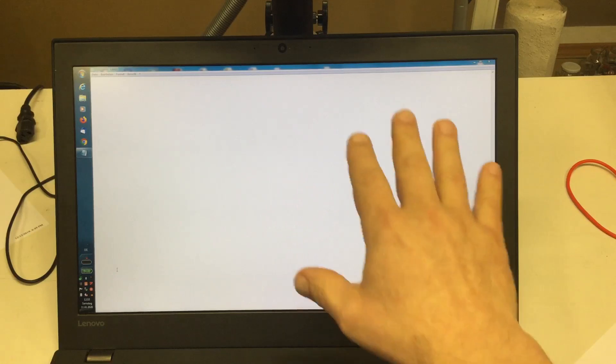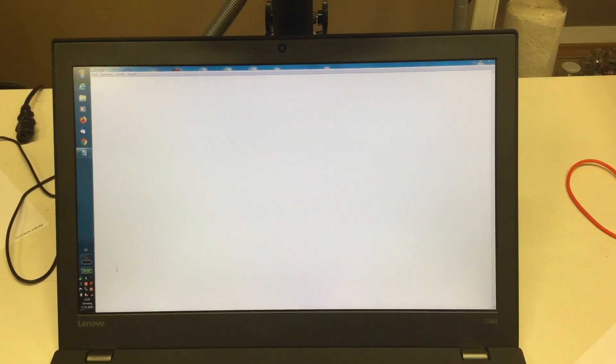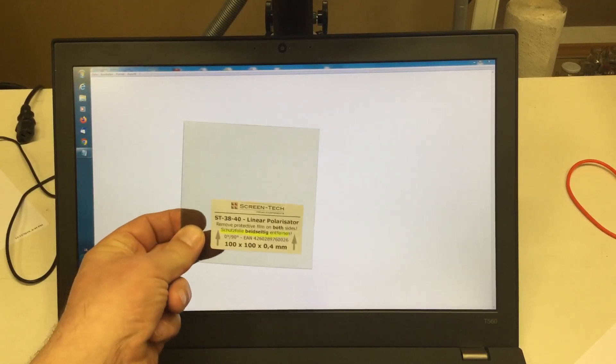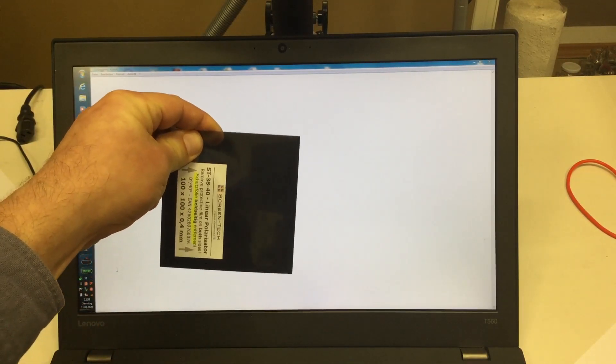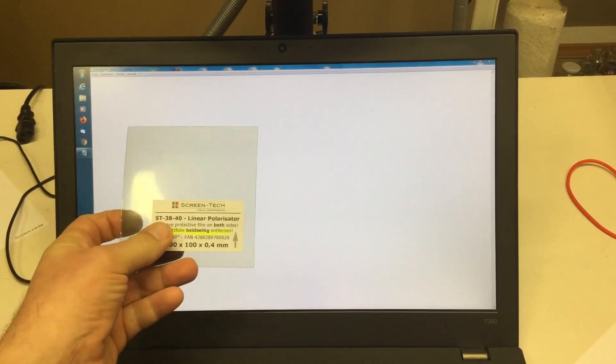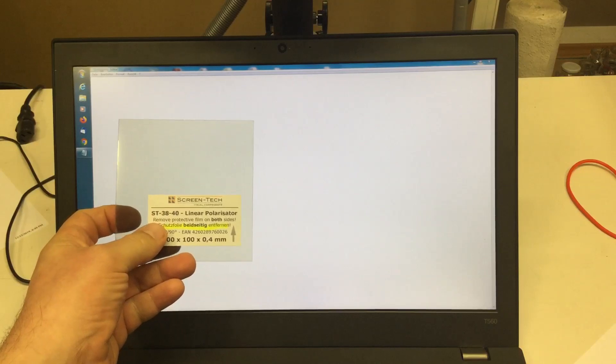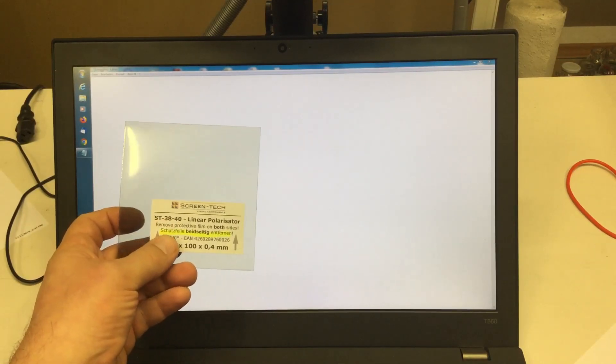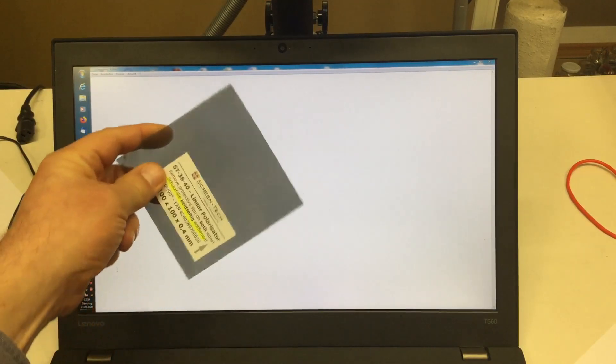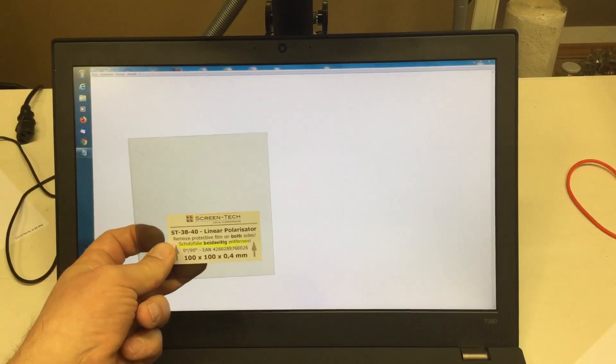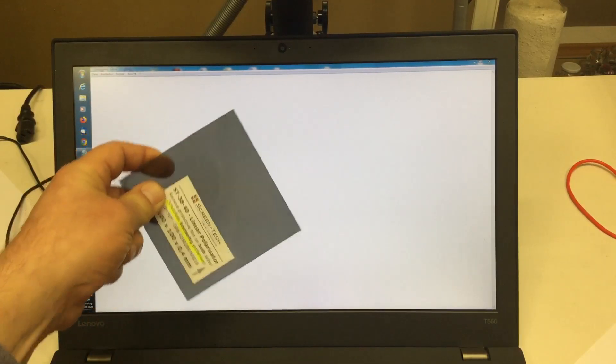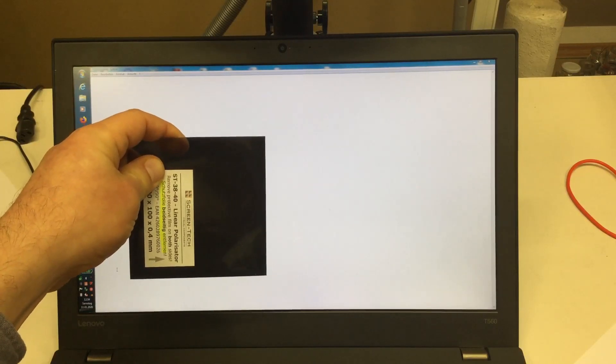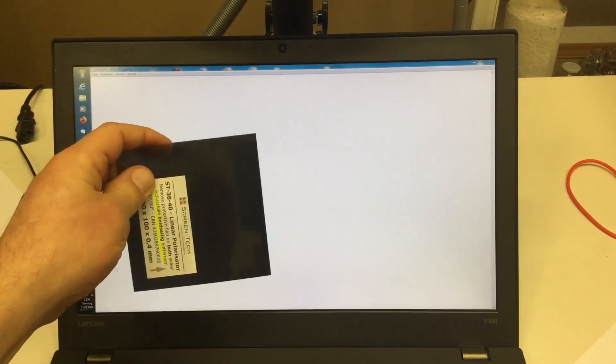In front of a better quality LCD screen, you will see this effect is much more dramatic. When I turn that here, okay, it's almost black. And this is quite good polarization film. It claims to do polarization of about 99.4%, whatever percent, 99.5%. So this is almost black.